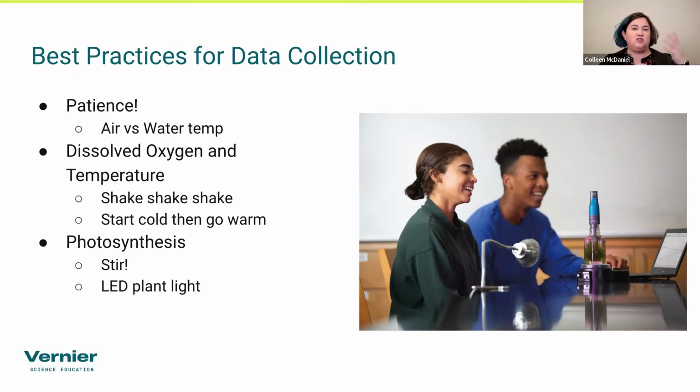In salt water, you have some ions that cause the readings to be a little different. Usually there's an equation you put your dissolved oxygen reading in to correct for the salinity. But on our Go Direct oxygen probe, you turn that channel on, you enter what your salinity is in PPT, and it automatically does the correction for you and does that readout.